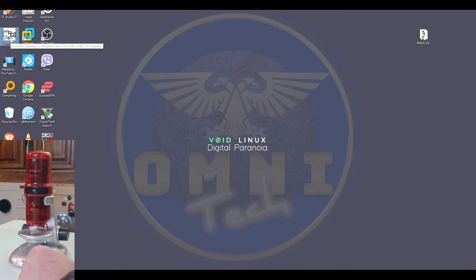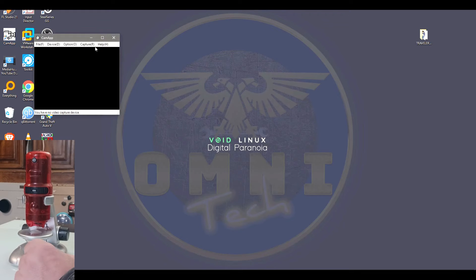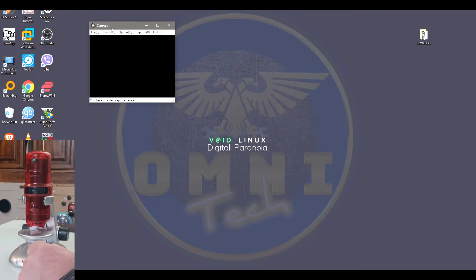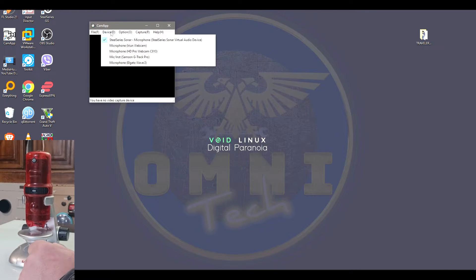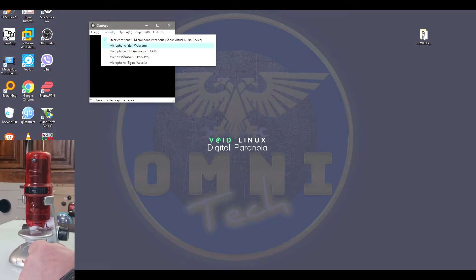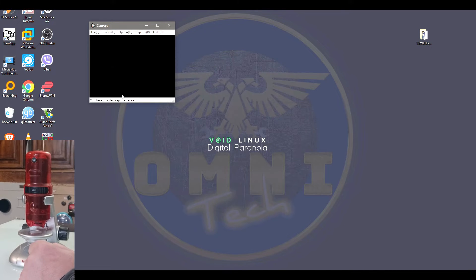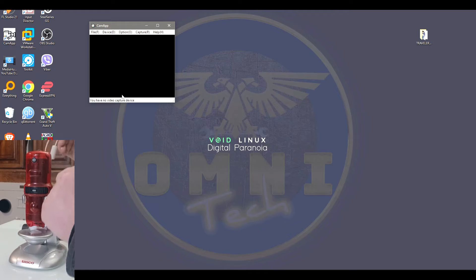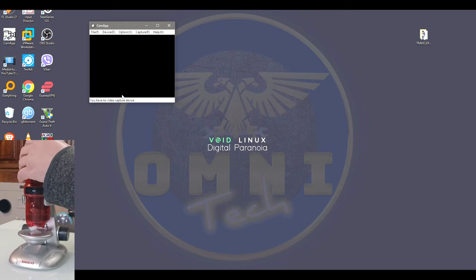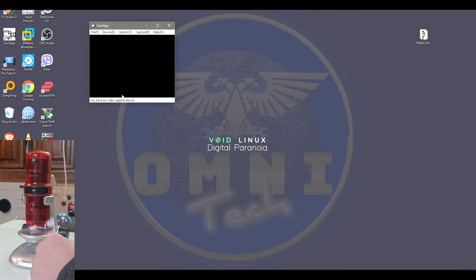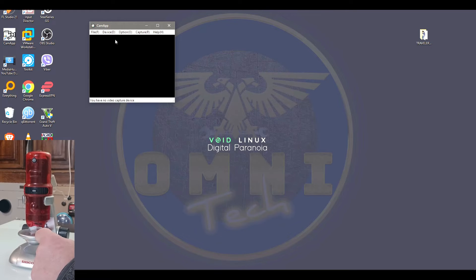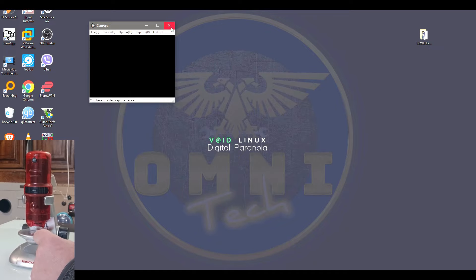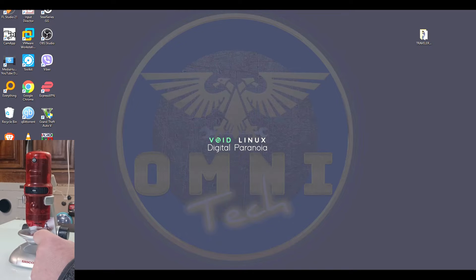After the restart, you'll have this app here. It just says Cam App. That is all. It doesn't look like anything. But when you go to devices, you'll see if your camera appears there when you connect it. It will show up as USB camera. Let me close it.